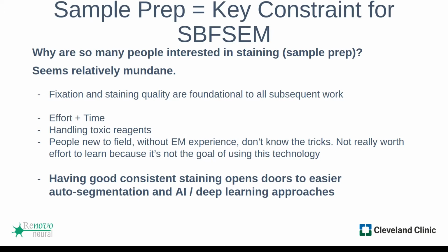So in the slides before this, I highlighted a few applications that many labs routinely do to highlight that serial block face EM is an important technology to glean data that are difficult or impossible to obtain in other ways. And serial block face EM is a relatively easy technology to use, as in the serial block face systems and the software themselves.